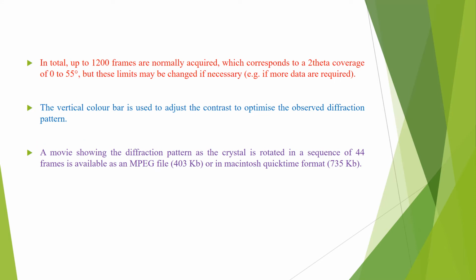In total, up to 1200 frames are normally acquired, which corresponds to a 2 theta coverage of 0 to 55 degrees. But these limits may be changed if necessary.